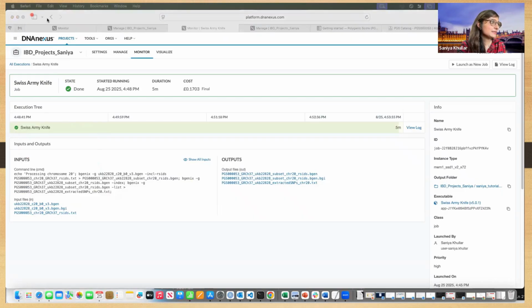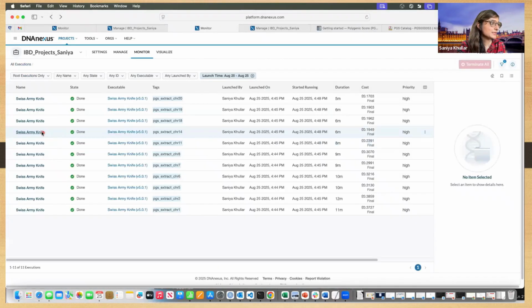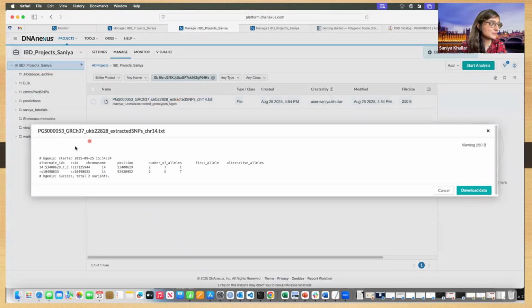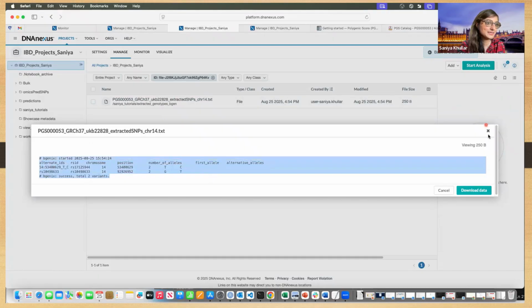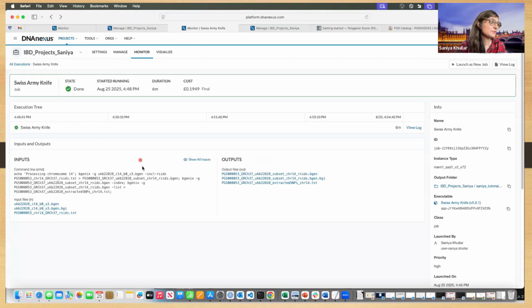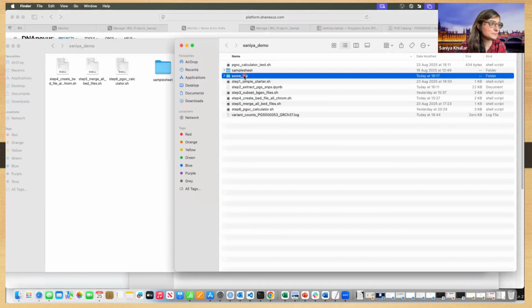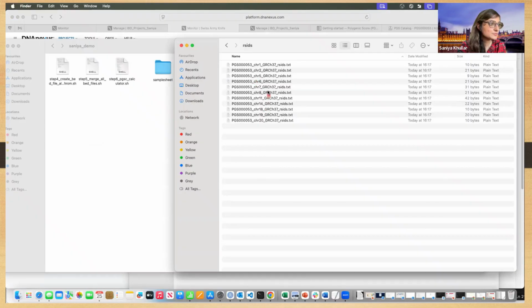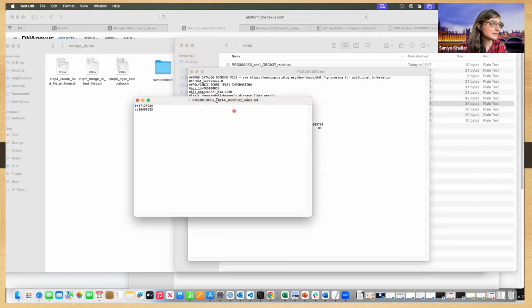So similarly, that's what we also will observe for this chromosome here, chromosome 14. We can also see what extracted SNPs those were here. We got these two SNPs extracted from the BGEN file that we needed. And that's what we were wanting for chromosome 14. We had those two SNPs that we needed, and those were what was extracted.